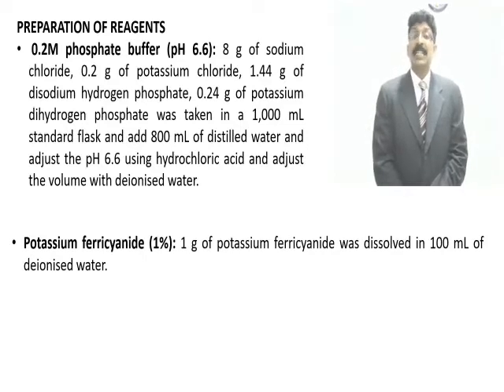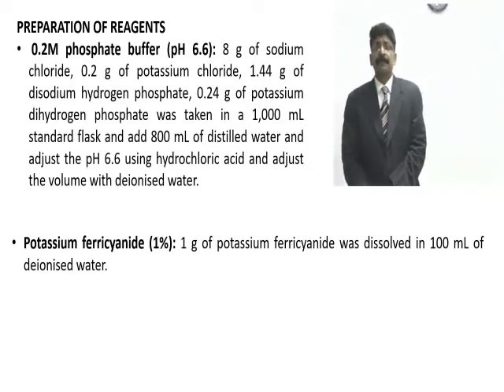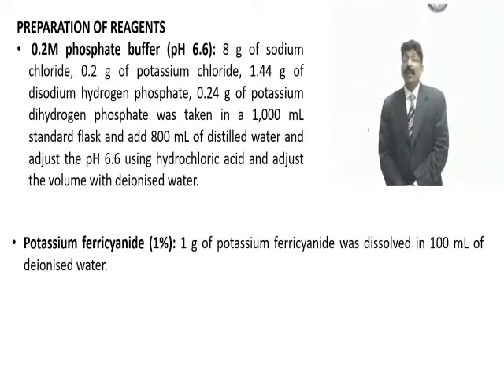Potassium ferricyanide 1% is also needed for this experiment. 1 gram of potassium ferricyanide was dissolved in 100 ml of deionized water.